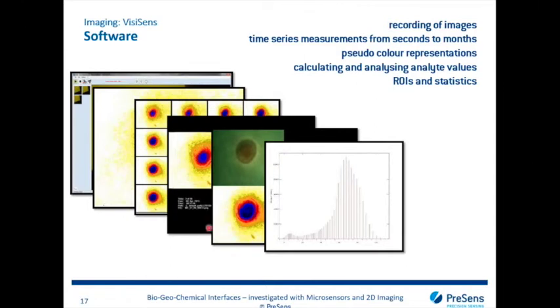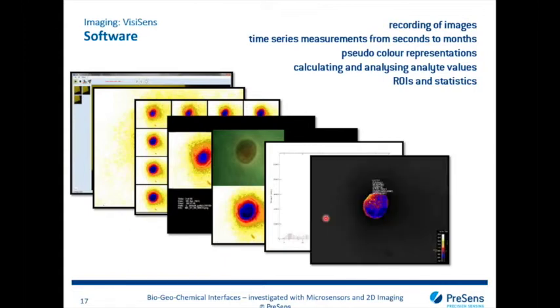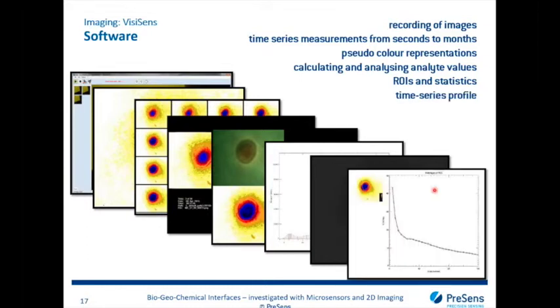So usually you have your image recorded, and then you can choose a region of interest that you're interested in, for example some metabolic hotspots, and then you can do statistics with these. You can do, for example, histograms, but also get average values and standard deviations, etc. And you can also do time series profile plots of various regions in your data sets.